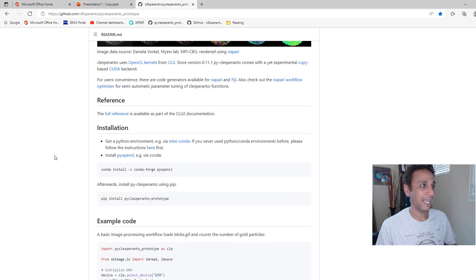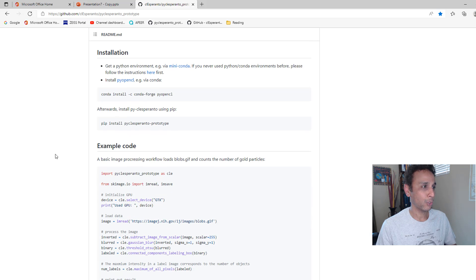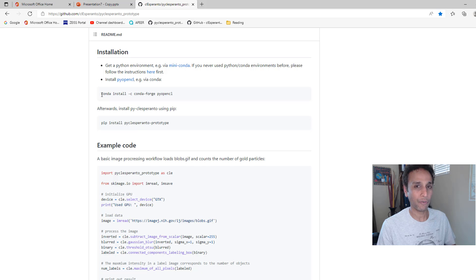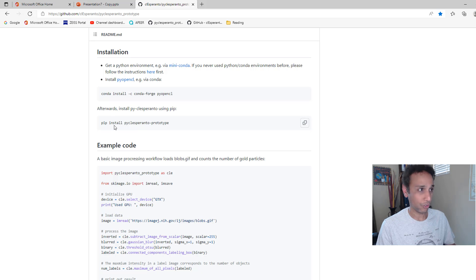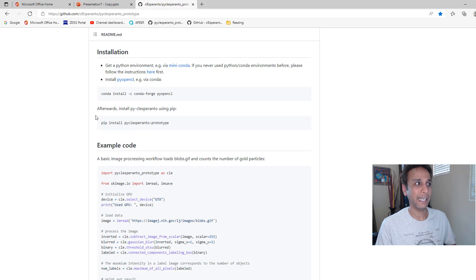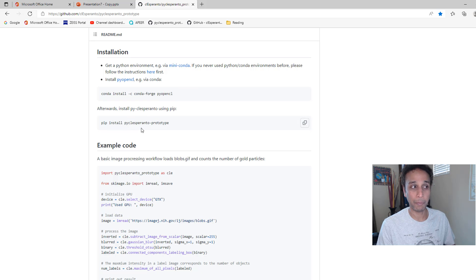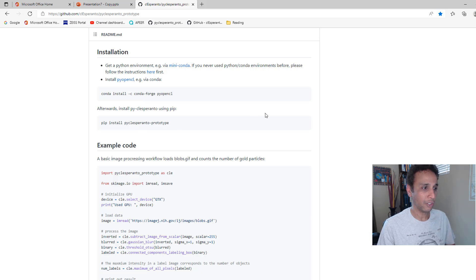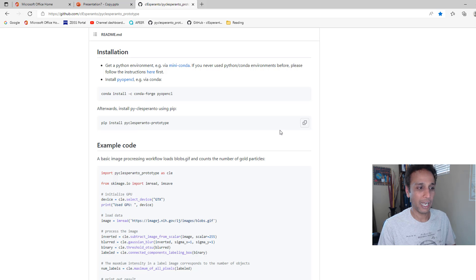One note: the way to install this is pretty straightforward as long as you follow the instructions. First, install PyOpenCL and then do the pip installation of this library. Now you have the power to segment anything using a single line.